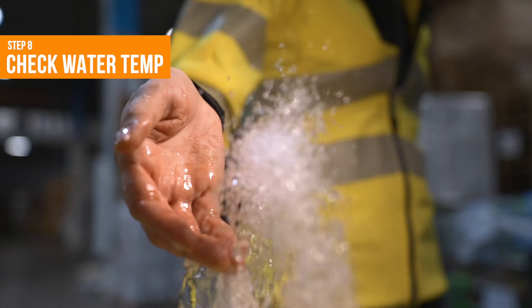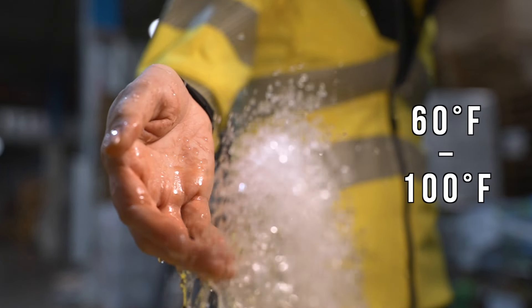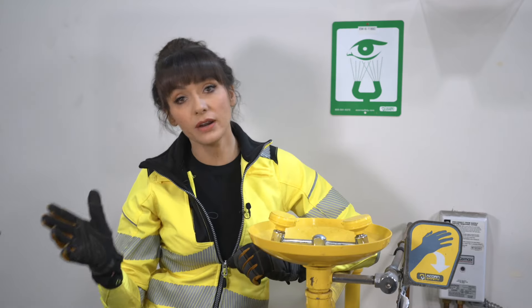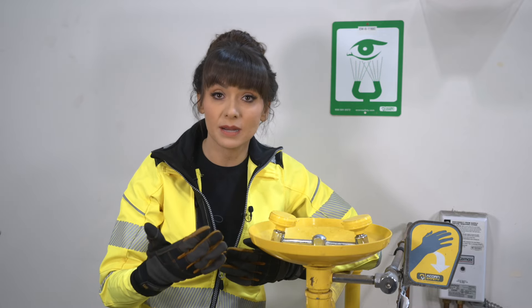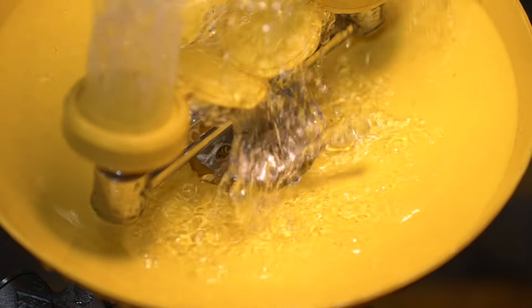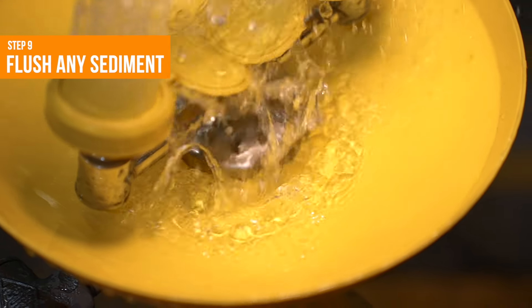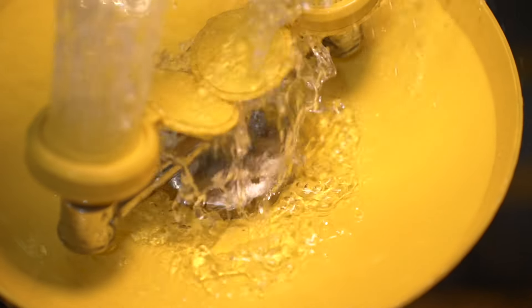Step 8: Check that the water is tepid, or roughly between 60 and 100 degrees Fahrenheit. Water that's too hot or too cold can actually cause damage, so you want it to be a temperature that you could actually flush your eyes with for 15 minutes. Step 9: If you find sediment in the water, run the water until all sediment is cleared from the supply line.